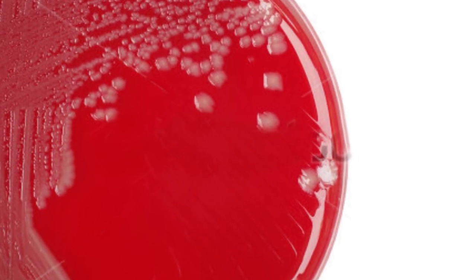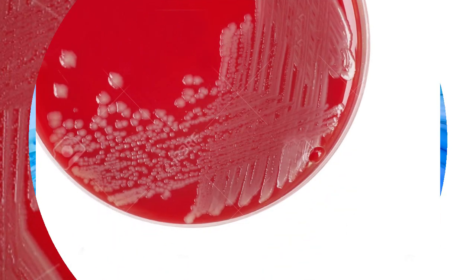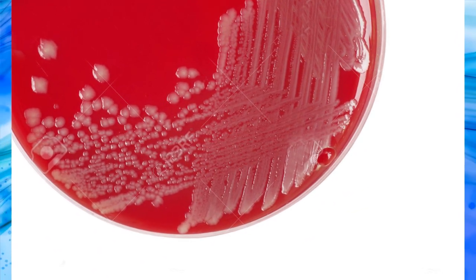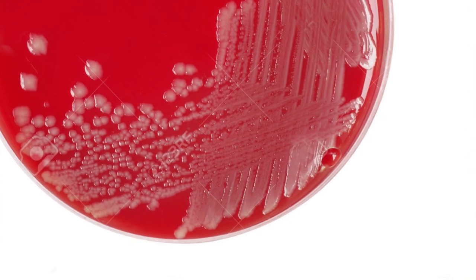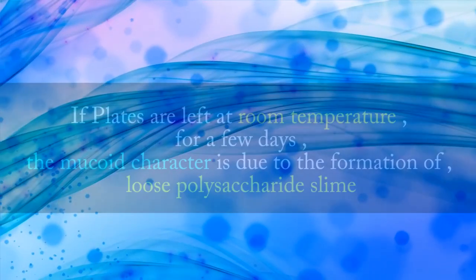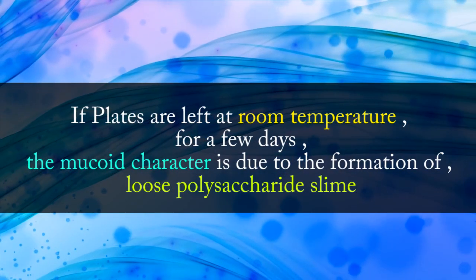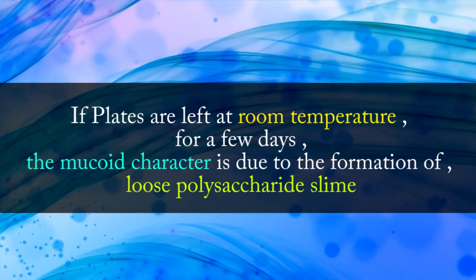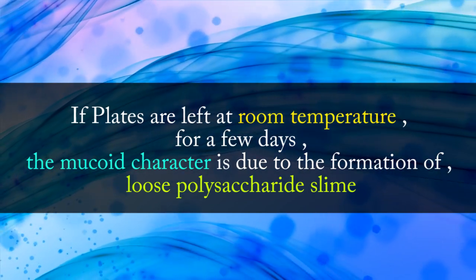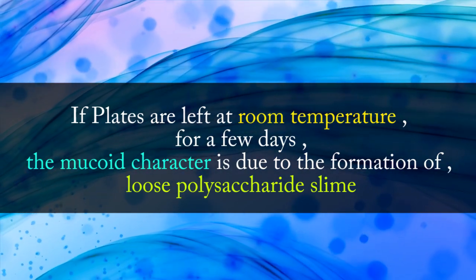When plates are left at room temperature for a few days after incubation for 24 hours at 37 Celsius, the mucoid character is due to the formation of loose polysaccharide slime.